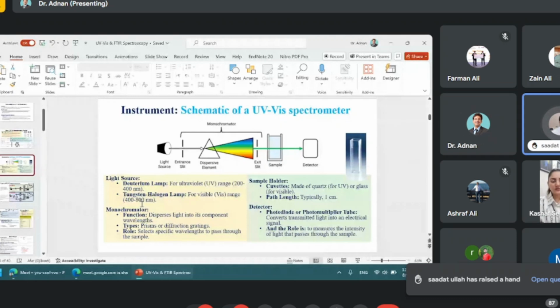Yeah, I have a question. When we are running UV spectrophotometers and we want to determine the concentration of, let's suppose, methylene blue after adsorption of these dyes on activated carbon. Let's suppose I put a 100 ppm solution into the flask containing activated carbon, and it absorbs most of the methylene blue. And let's suppose at the end only 20 ppm solution remains.